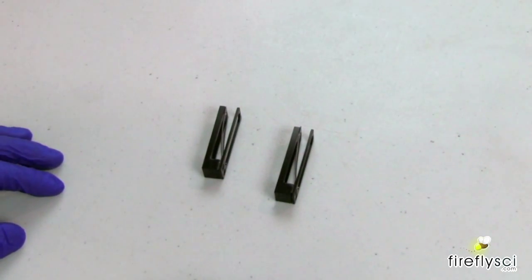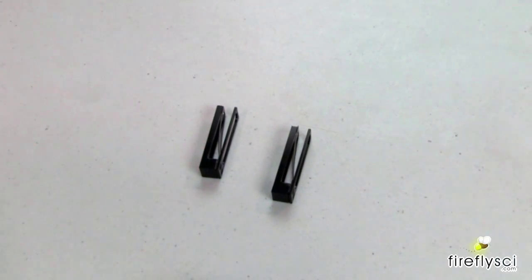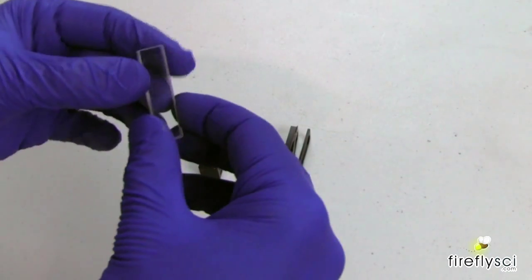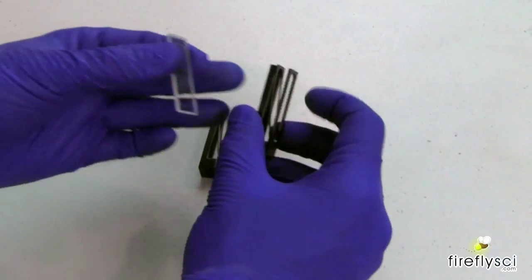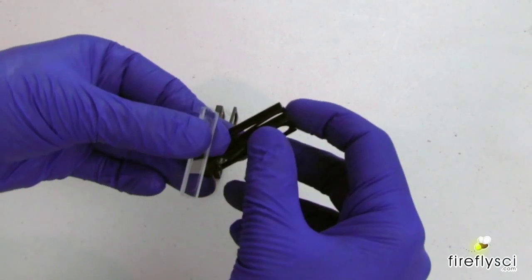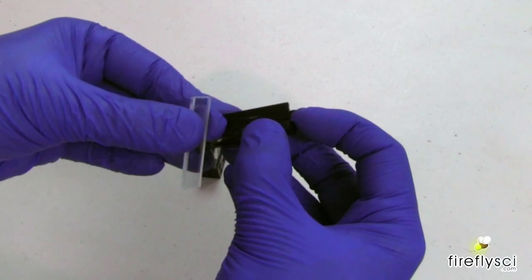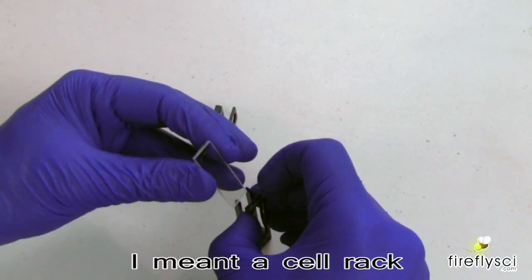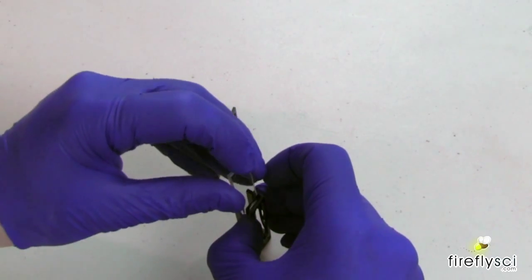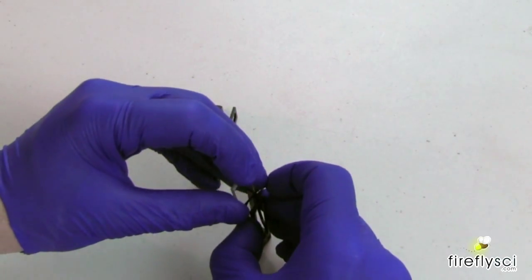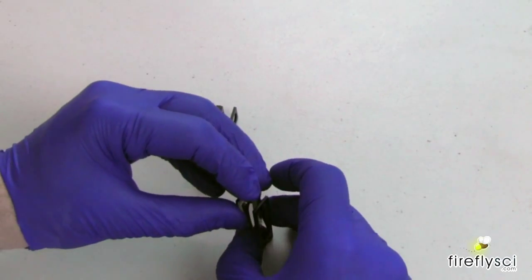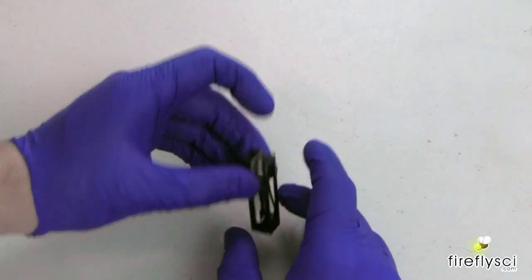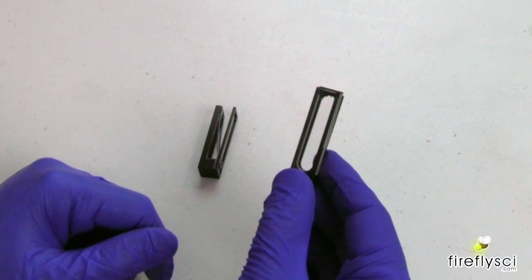So we're going to show you how to load both the Type 49 and the Type 20 cuvettes in these mounts. So let's start with the Type 20. Now I didn't put a sample on this because we're just showing you how it goes in here. So all you have to do is pull the spring back with one hand. It's much easier if you use a cell mount for this. And gently slide it right down into the holder. And it's all set and ready to go.